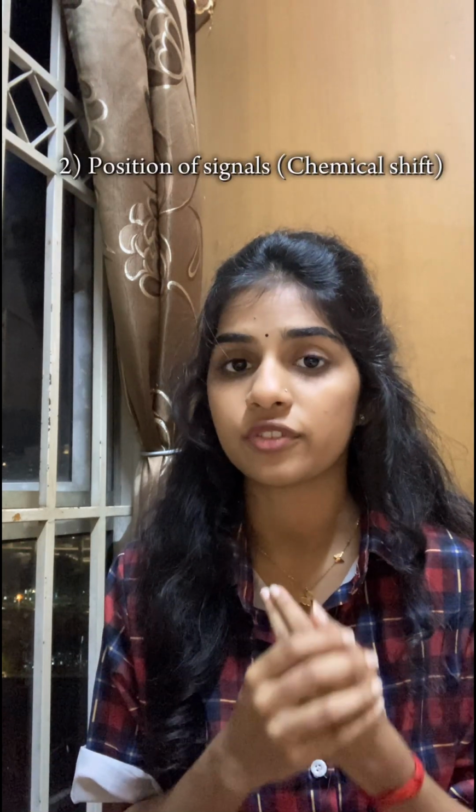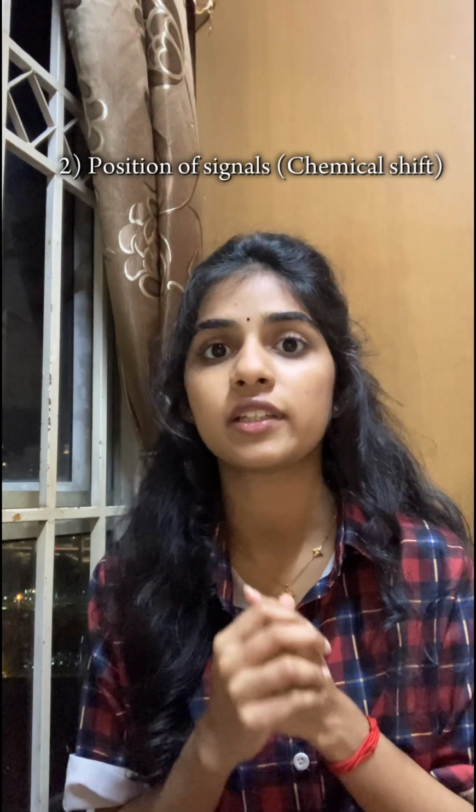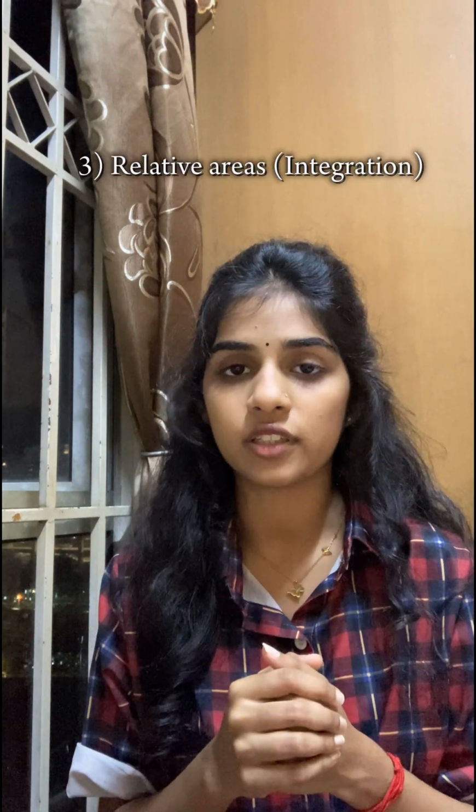Moving on, an NMR spectrum provides 4 critical pieces of information. Number 1, the number of signals. This tells us how many distinct types of hydrogen environment exist in the molecule. Secondly, the position of signals, which is also known as the chemical shift. The chemical shift indicates the chemical environment of each type of hydrogen. Third, the relative areas, also known as the integration. This tells us the number of protons in each environment.